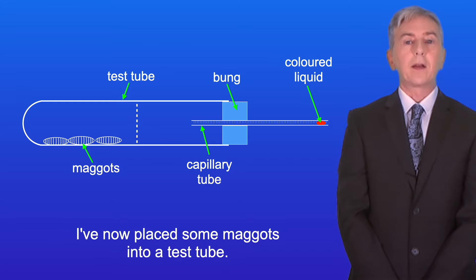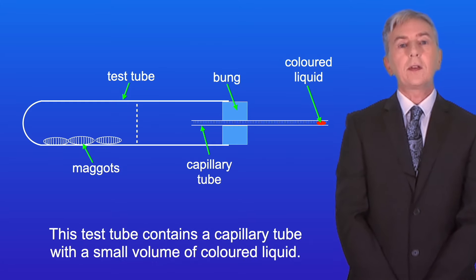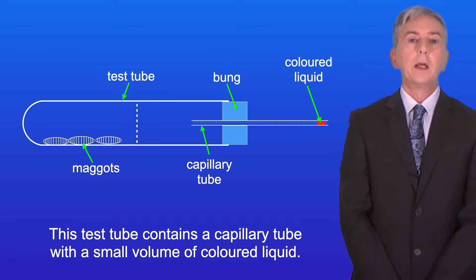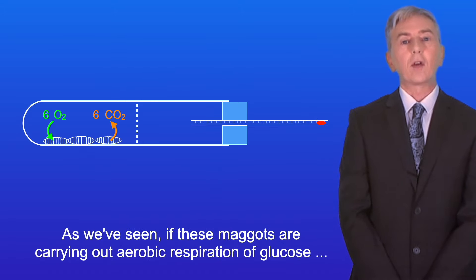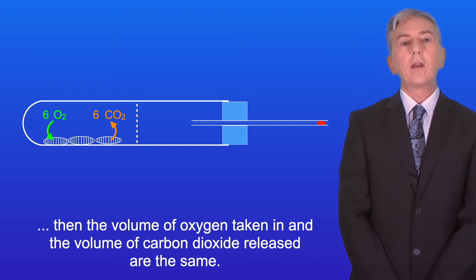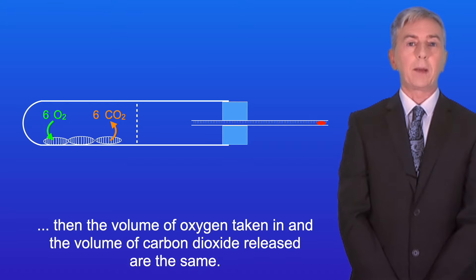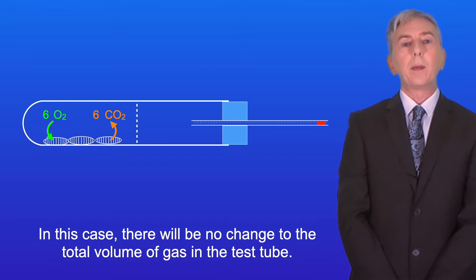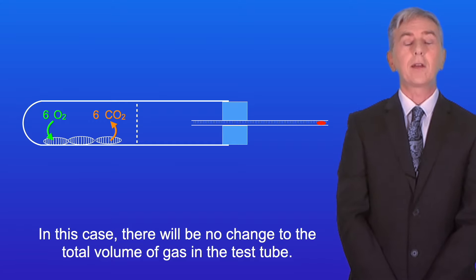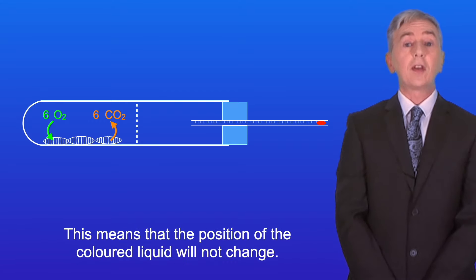I've now placed some maggots into a test tube. This test tube contains a capillary tube with a small volume of coloured liquid. So as we've seen, if these maggots are carrying out aerobic respiration of glucose, then the volume of oxygen taken in and the volume of carbon dioxide released are the same. So in this case there will be no change to the total volume of gas in the test tube, and this means that the position of the coloured liquid will not change.